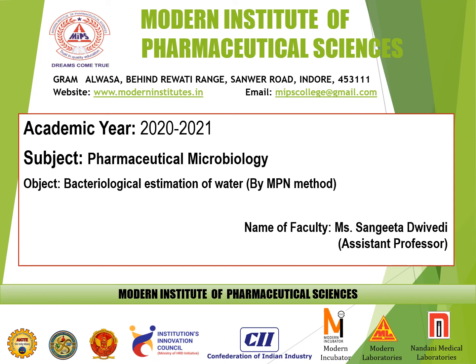Good afternoon, everyone. I'm Sangeeta Dwivedi, Assistant Professor of Modern Institute of Pharmaceutical Sciences, Indore. Today, I'm going to explain how to do bacteriological estimation of water by most probable number method.